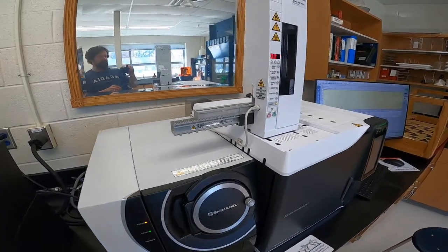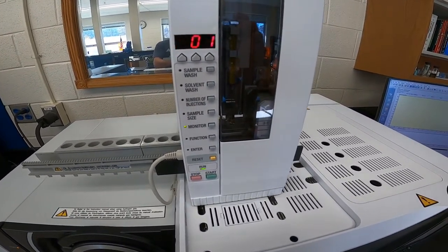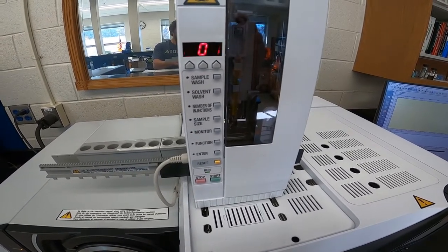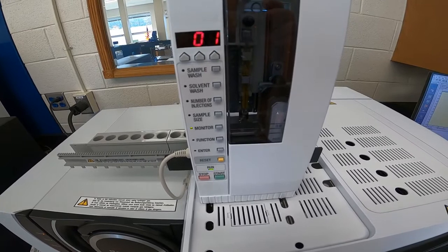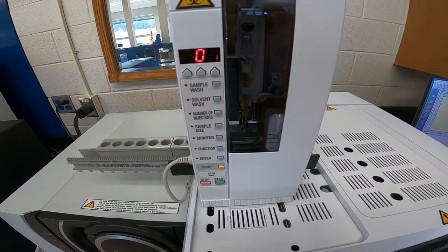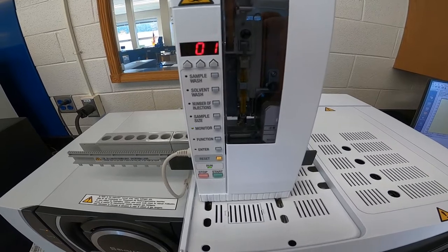So what I'm showing you now is just the auto injector. If you can see in there, there's a very small needle, and what it's doing is washing the needle with a solvent, hexane. It does 3 washes, and in our sample vial that I put in the little tray, we'll move over, and then it will extract exactly 1 microliter and inject the 1 microliter.